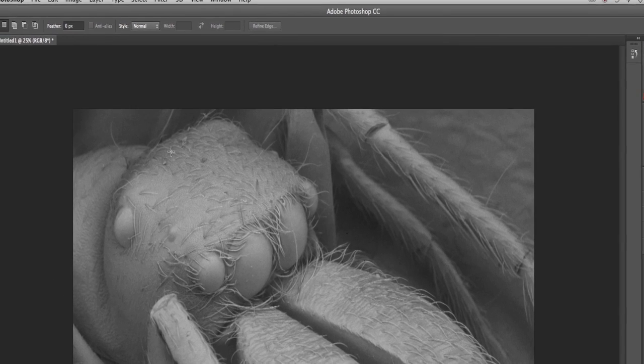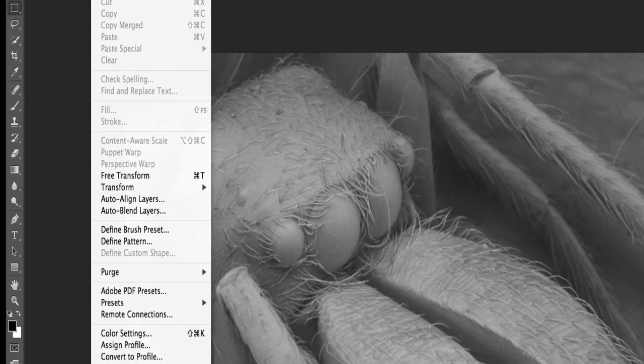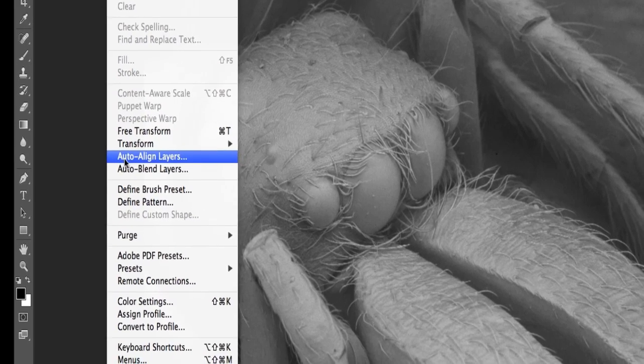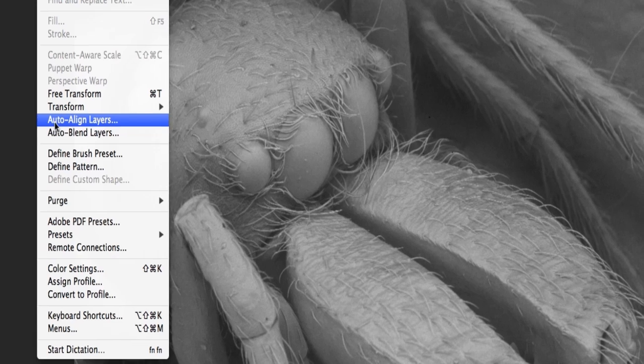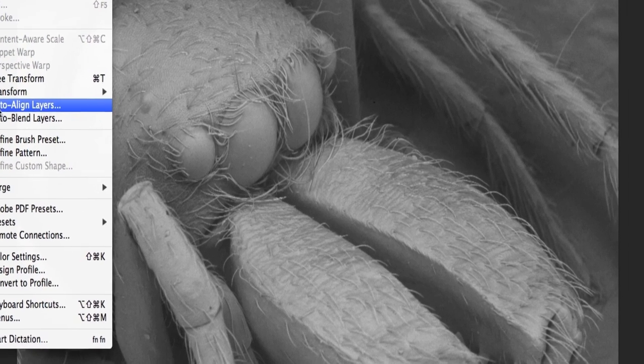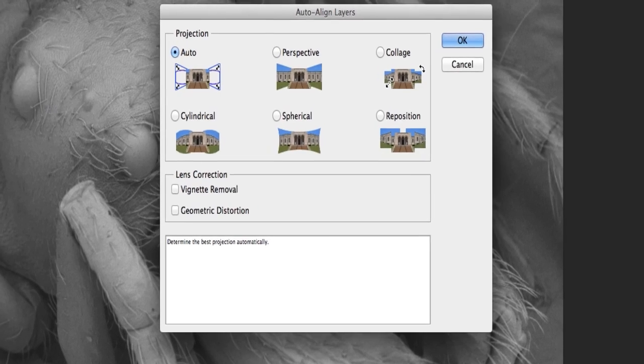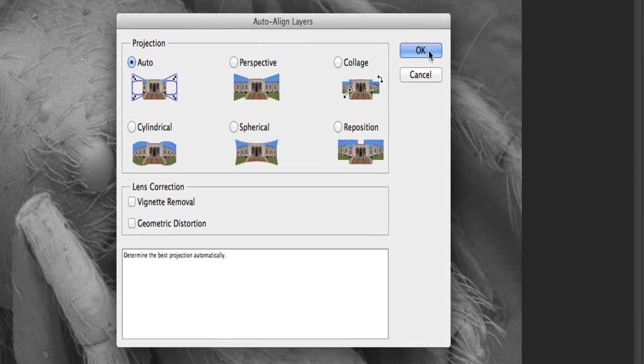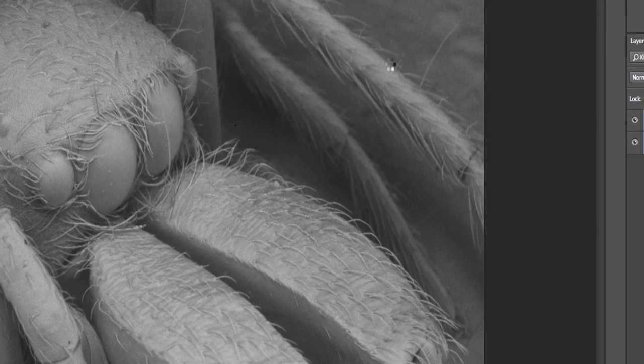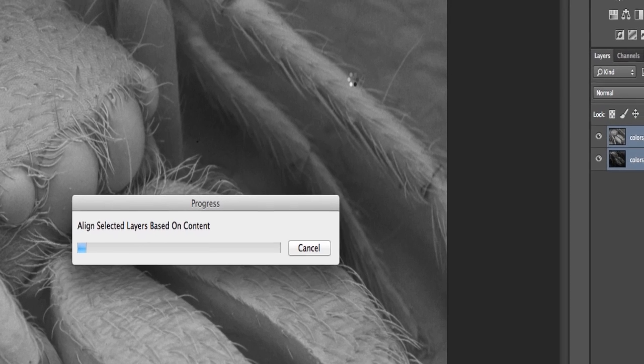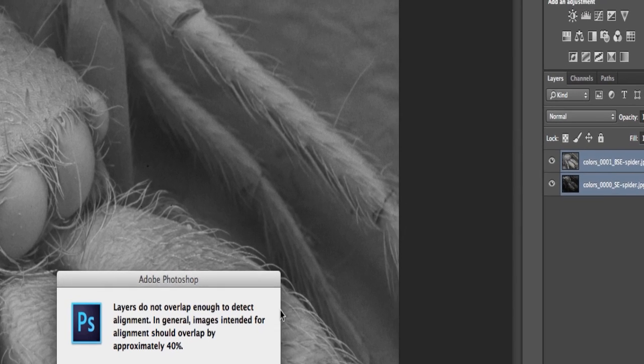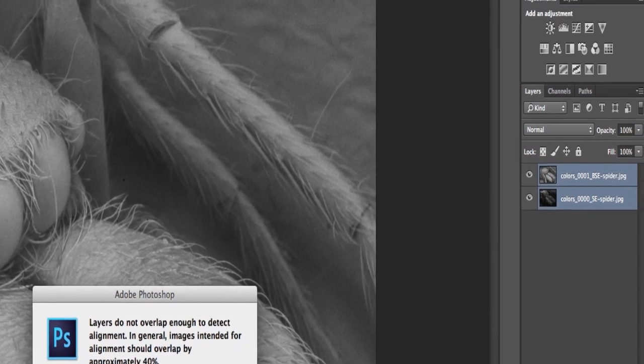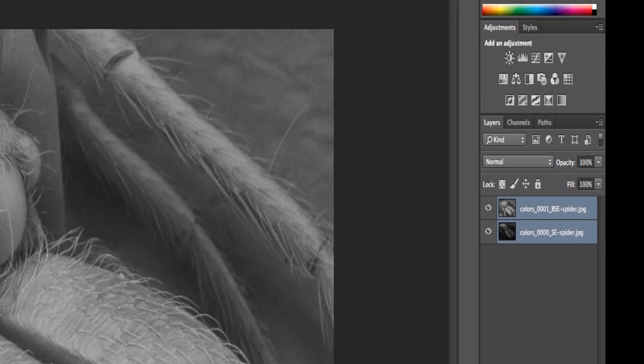And I'm going to come up under Edit, and I'm going to say Auto-Align Layers. And what this will do is this will try to take all the structures and kind of warp each image to get it to the best alignment possible. So under Projection, I hit Auto here. I go OK. Now at this point, it might move some of the images around a little bit, and it can take a while, depending on how big your images are. And sometimes I'll give you these errors that says it just can't deal with it. Click OK, and we'll give it a try anyhow.